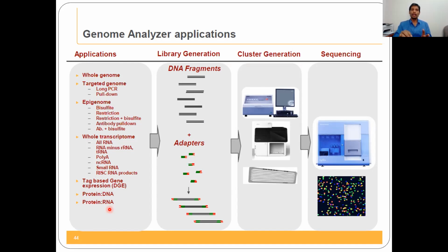What they are doing is purifying that protein. They are cloning, all genetic engineering, right? They are using all genetic engineering tools to clone, and they are using downstream processing technology to purify the protein. After purifying the protein, they bind it to the RNA. After binding the RNA, we sequence using Illumina. After that, we analyze the data.